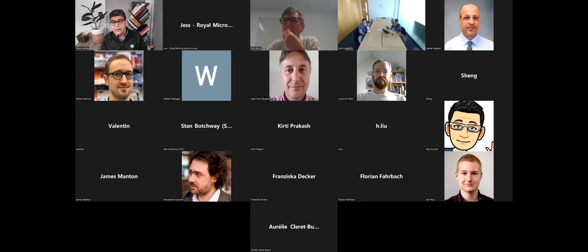So have you tried this on clear tissue? While most RI variations are eliminated, residual tiny variations may have valuable information while allowing to image very thick samples. We have. So the clearing does help. We have tried it in collaboration with our colleagues who work with zebrafish. You can clear an adult zebrafish, and you can see the axon structure in the brain with that. The parameter to fine tune is how much lipid you extract, because most clearing methods do extract lipids. And that can lead to loss of contrast. There are a few methods that are designed to do index matching. And some of them are very simple, embedding the sample in a crowding molecule. They really work well. So with that, you can reduce the scattering, image deeper, but not lose the structure that gives rise to the contrast.